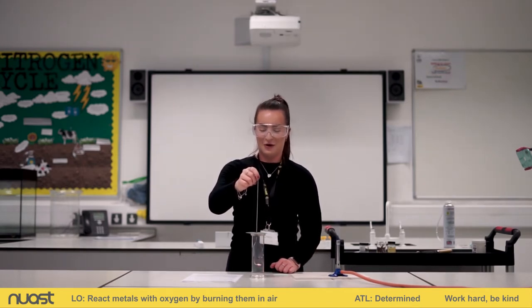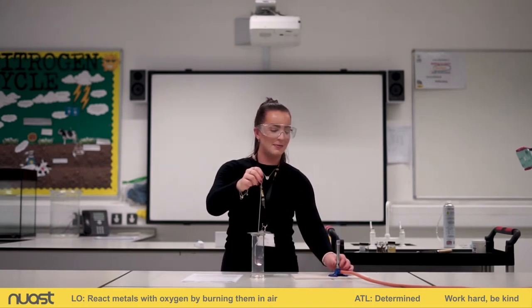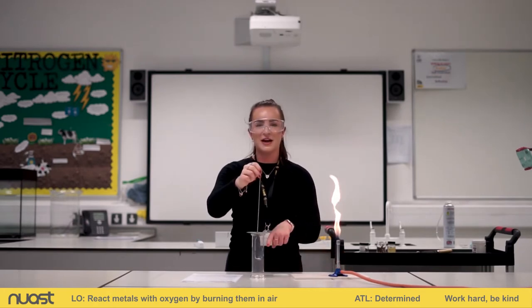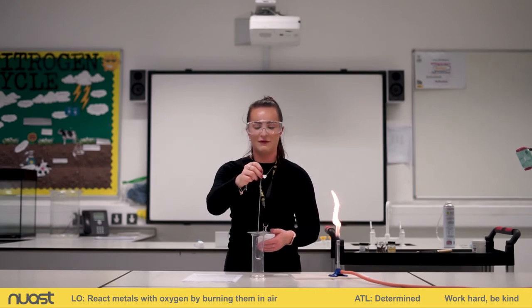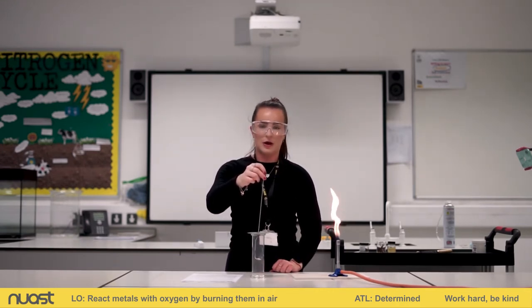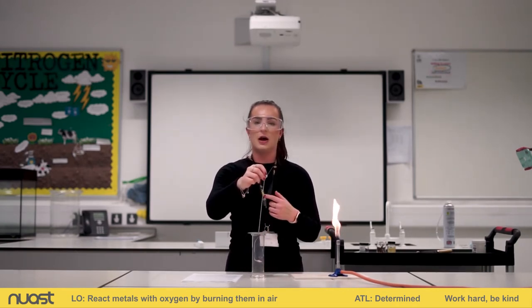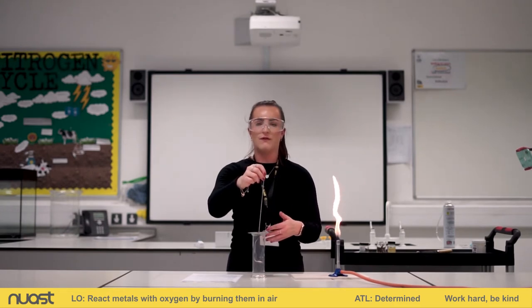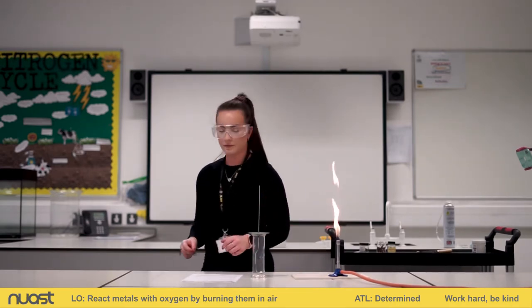Okay, so hopefully what you saw during that was as I took the magnesium out of the Bunsen burner, you saw that bright white flame. And then straight when I put it into this cylinder, there was a much brighter white flame. If you'd actually seen that in person, that would have definitely made your eyes hurt a little bit. So what we could definitely see there is when the magnesium was burning in a high concentration of oxygen, it was a more vigorous reaction. That's why we got that brighter white flame. So I'm going to go over to the visualizer and we'll write that one down in our table.